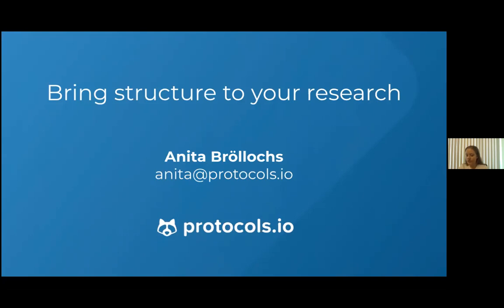And it looks like there's another question. Can you publish a protocol from a private group? That's another great question. And yes, you can, but if you do publish a protocol from a private group, it won't be associated with that group. So if you have an invisible workspace and you publish a protocol from that workspace, it won't be associated with that workspace because the workspace is invisible. So others won't be able to see it.